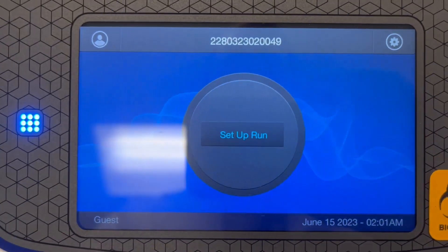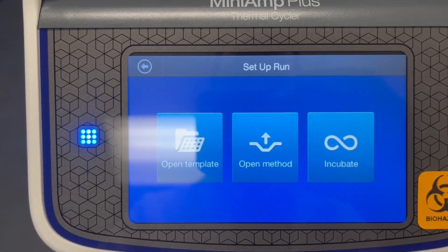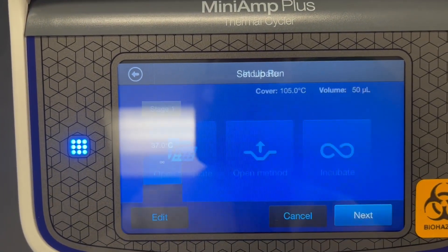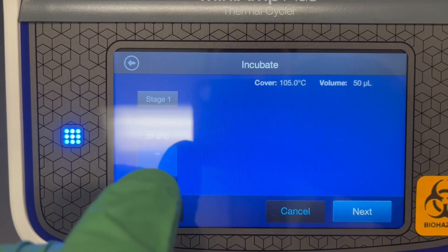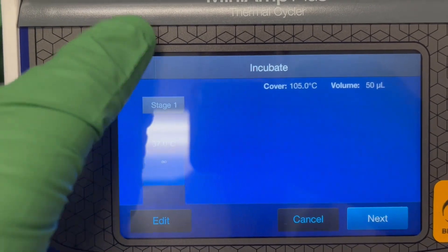We go in, hit Startup Run, and then if you have a method you can click it, or there's also an incubate option where you can set the temperature of the stage if you just wanted to incubate your samples at a given temperature.